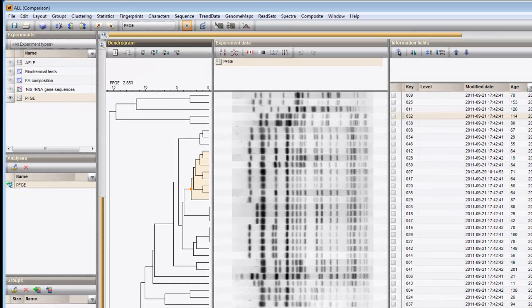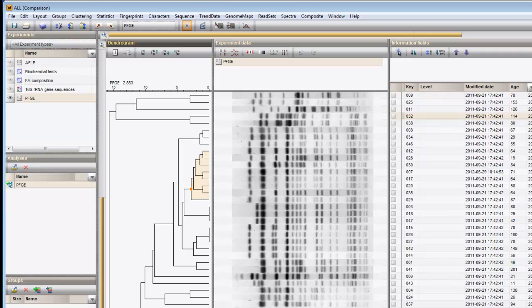I can click on a branch to highlight it, and the average distance for the branch is displayed in the upper left corner. I can move the branch up or down with the move branch buttons.